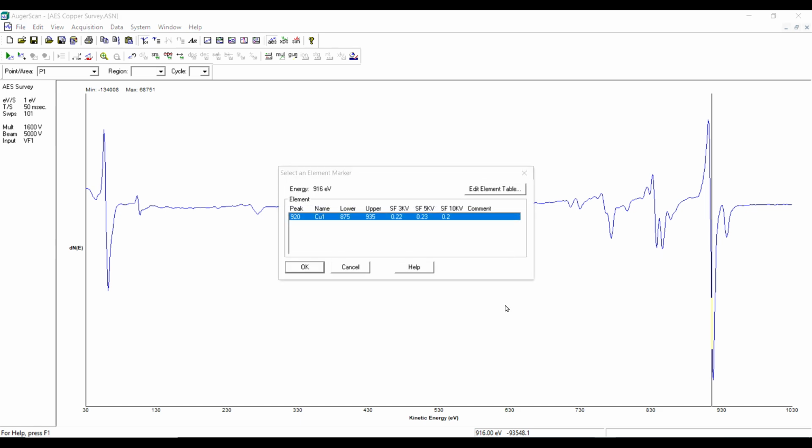There we go. Okay, this screen recorder is kind of goofing up the functions of my mouse, and so it's not working. But you basically pick the lower part of the peak, and then you hit the right click on your mouse, and you get this message.